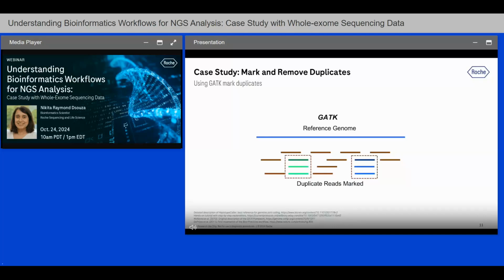Duplicate reads may arise through PCR, where a single library is amplified, resulting in excess of that same library. They may also arise from sequencing, where sequencing in excess may result in increased duplicate reads, or from RNA-seq, where in order to observe lowly expressed transcripts, we may oversequence highly expressed transcripts, increasing levels of duplication.